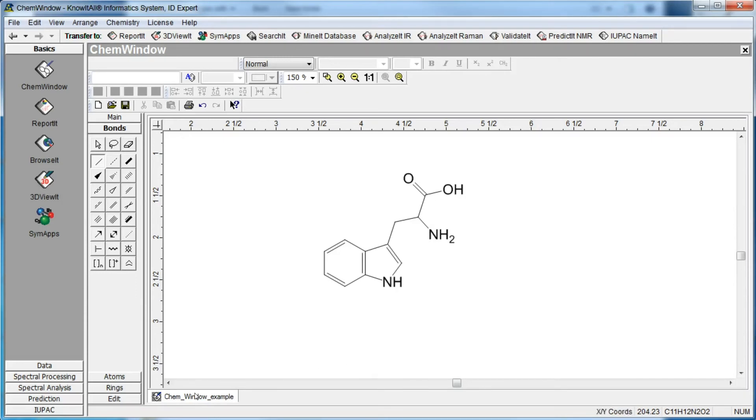The structure name is now displayed on the tab at the bottom of the drawing area. Now we'll edit the structure. Use the eraser tool to remove the parts of the structure you wish to change.